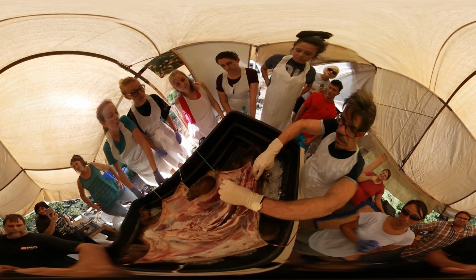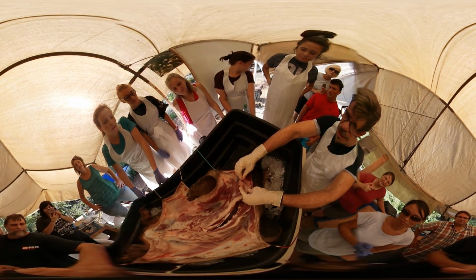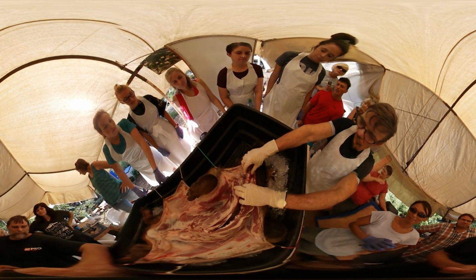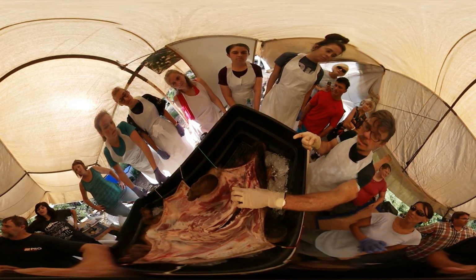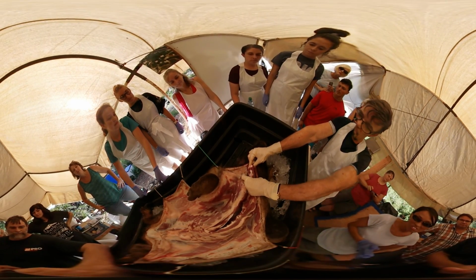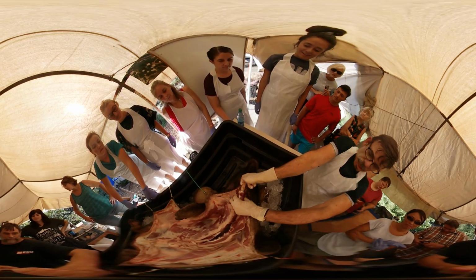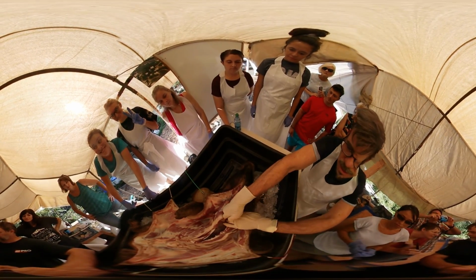So where's the thyroid? The thyroid gland is probably in this tissue here. Glands kind of collapse and you don't see much. It might be in this white tissue, though I don't actually see a distinct thyroid gland. That's where the thyroid would be for us. The thyroid gland goes into two lobes, like we talked about this morning, one lobe on each side with the isthmus. Up here above the larynx, see that thyroid cartilage? That's your Adam's apple. Going into the top of that is the pharynx, down to the larynx, that's the thyroid cartilage, and then into the trachea. It's an amazing trachea.